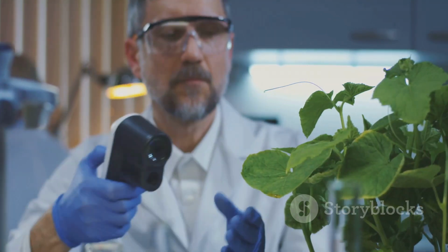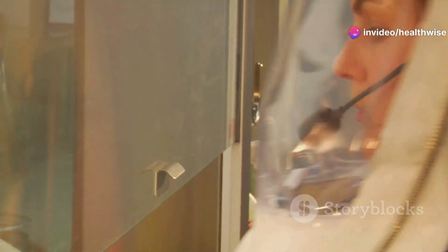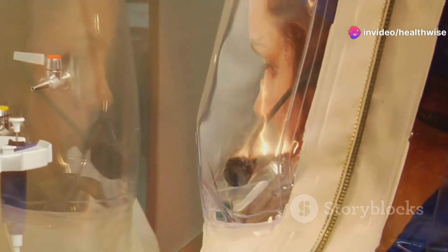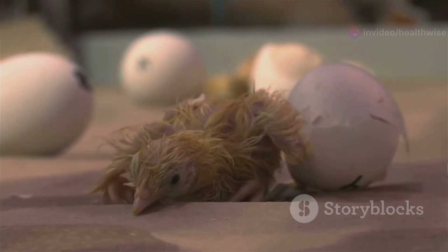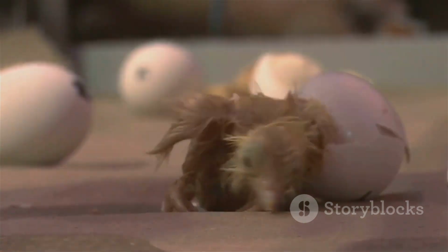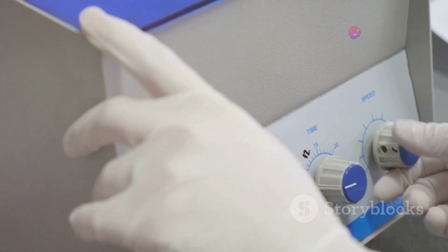This stability is critical for the growth and maintenance of biological samples. Without such precise conditions, it would be challenging to conduct many scientific experiments and medical procedures. In the world of science, maintaining specific conditions is crucial. Even slight deviations in temperature or humidity can affect the results.